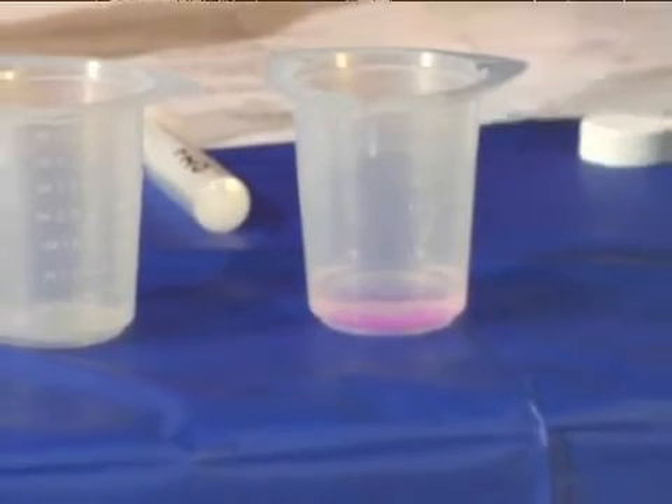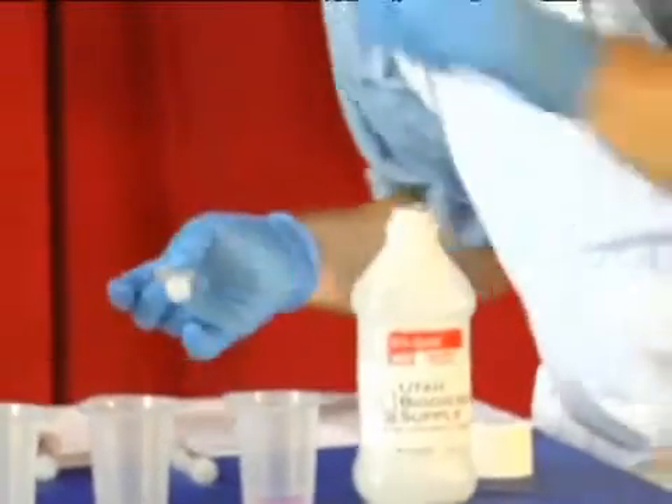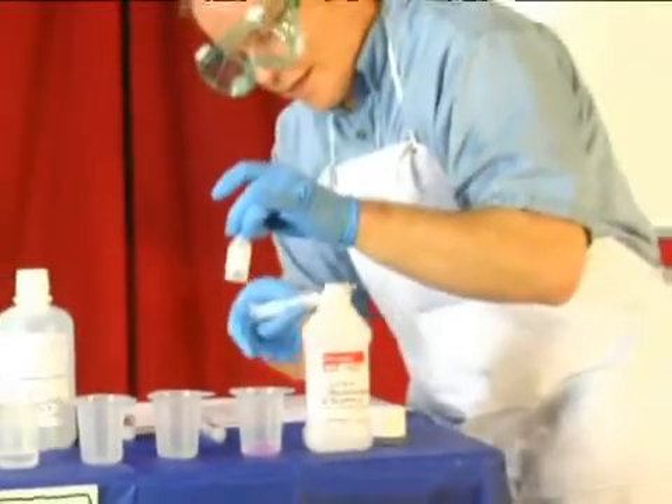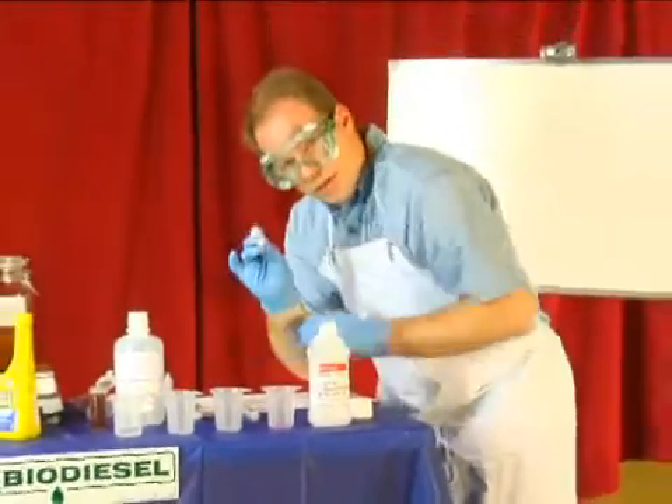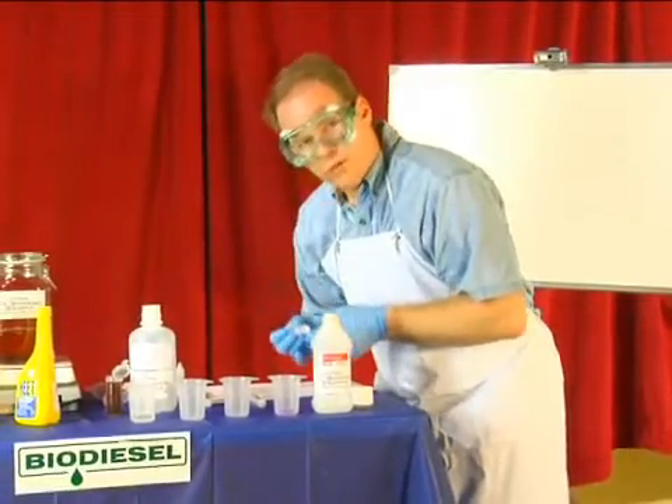So now we've done that, we can move on to titrating the oil. To recap: 10 milliliters of isopropyl alcohol, a couple drops of phenolphthalein, and then we added a little bit of our 1% titration solution. Once we're done, now we can move on to titration.